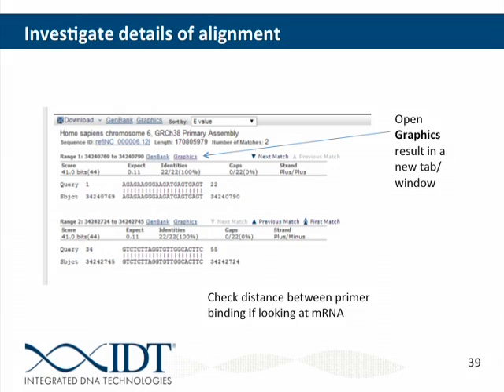And so here you can see by clicking on that graphics view, BLAST will open a window. And it's nice because it lays down our sequence right here that we input alongside of the transcript. And so you can zoom in or out here using that. You can zoom out with the negative sign. You can zoom into the sequence level, which we're at right now, with the plus sign. And you can grab within this window and drag the sequence side by side. Also convenient here is that you can configure for SNPs, which I will show in just a little bit as well. So you can actually do your BLAST alignment and checking for potential SNPs all at one time.